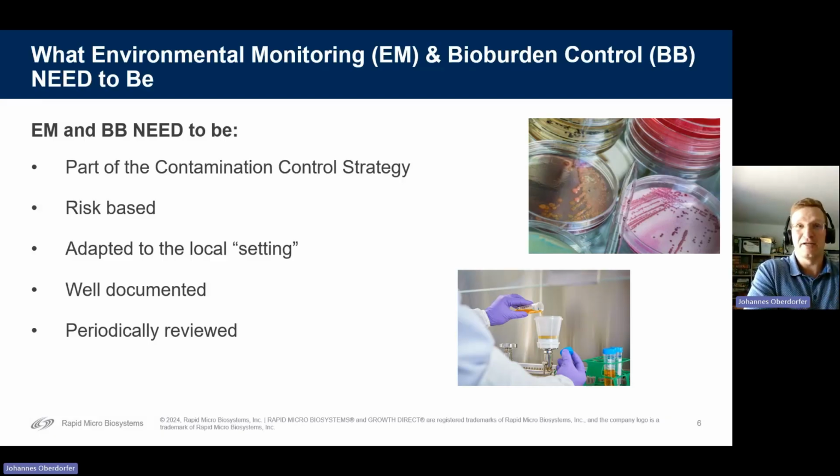And still, as we all know and as we all deal with it, there's also no clear, perfect guidance. On all conferences that I've attended where this topic came up, there's always the question: please give us guidance, give us advice, give us examples. But yeah, this is very difficult. So contamination control strategy is something that needs to be evaluated and set up specific for the circumstances.